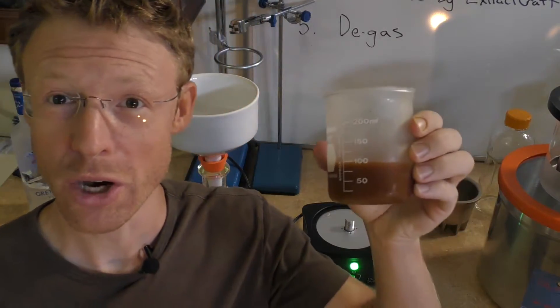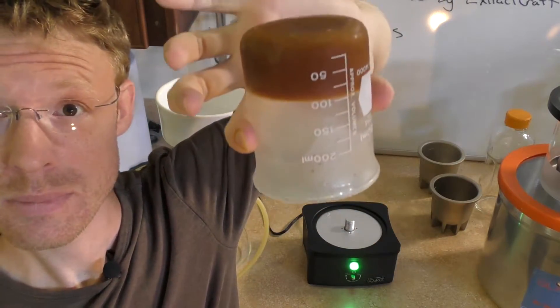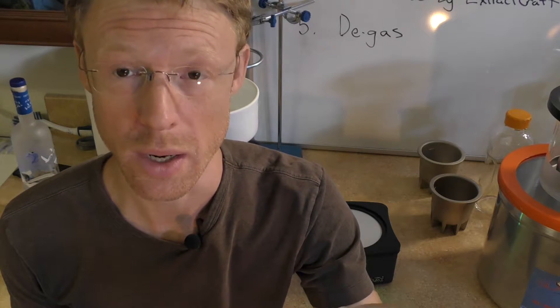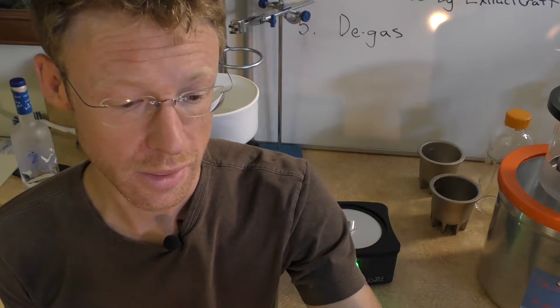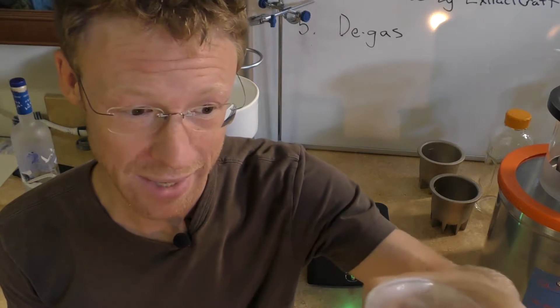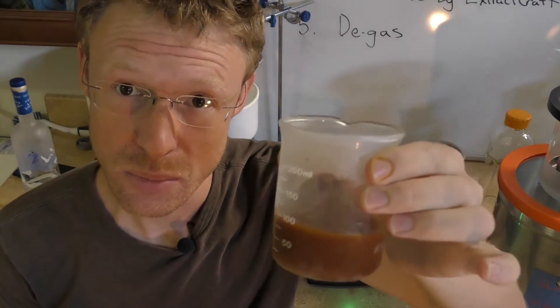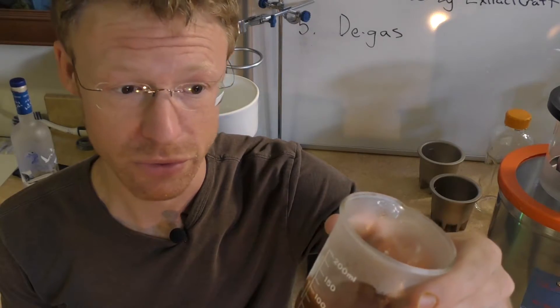I've just retrieved the wash from the freezer. It's pretty well congealed. It's vodka, not ethanol, so there's less ethanol in it than if I was using 190-proof alcohol. That must have extracted a lot of lipids or waxes over the seven years. So I'm just going to let this sit out for a little bit until it turns to a more liquid consistency, and then I'll put it through the Büchner filter funnel.